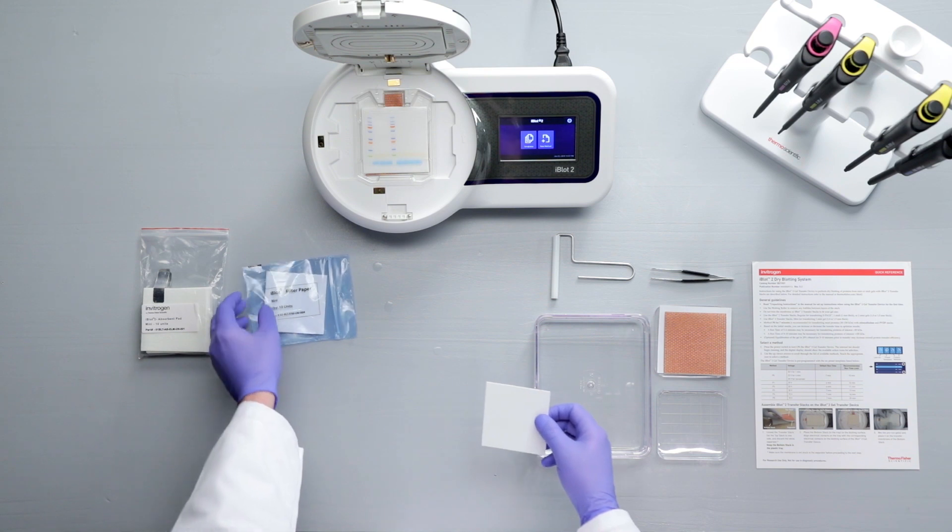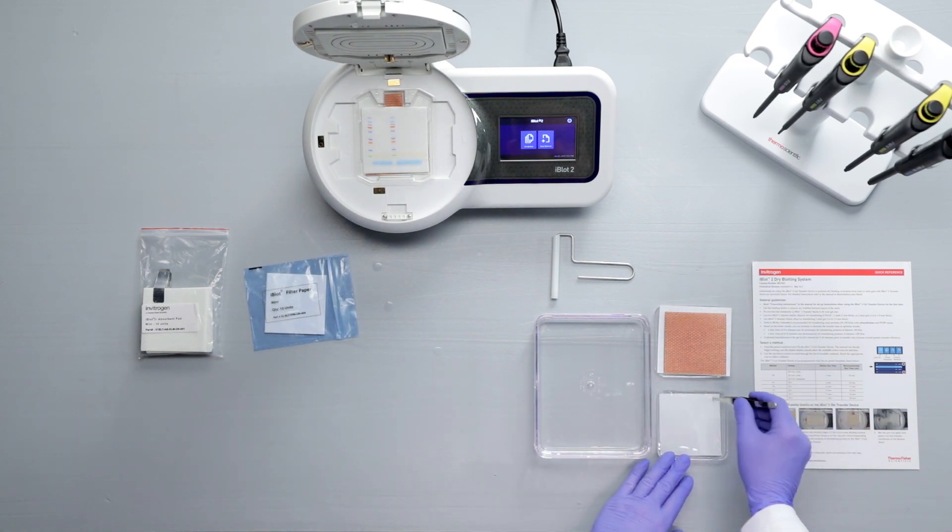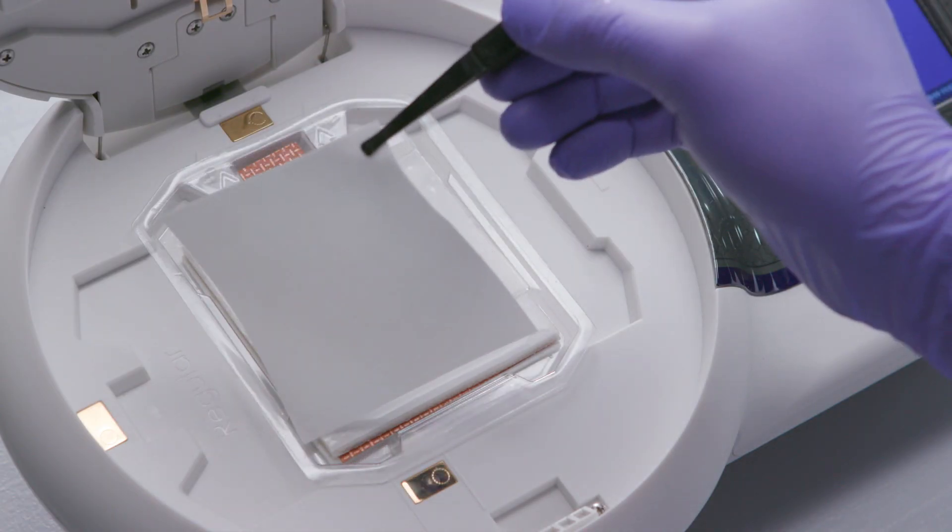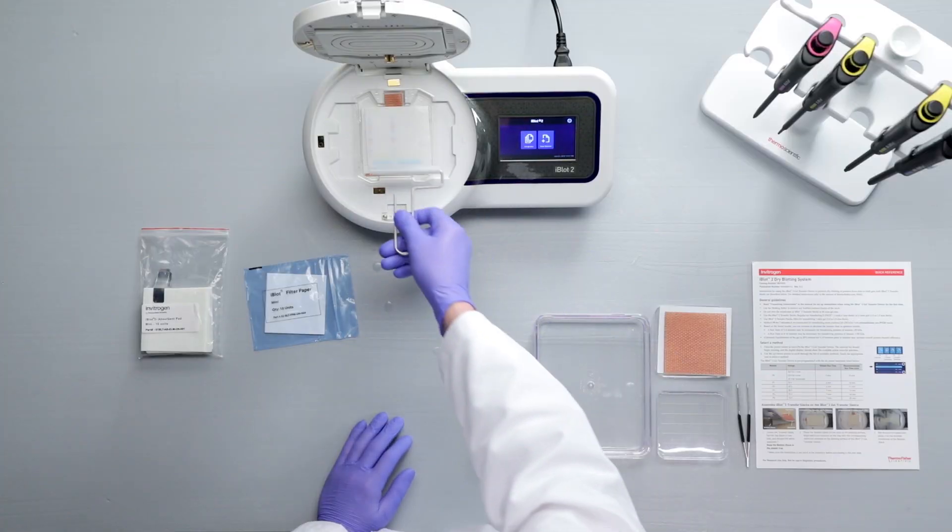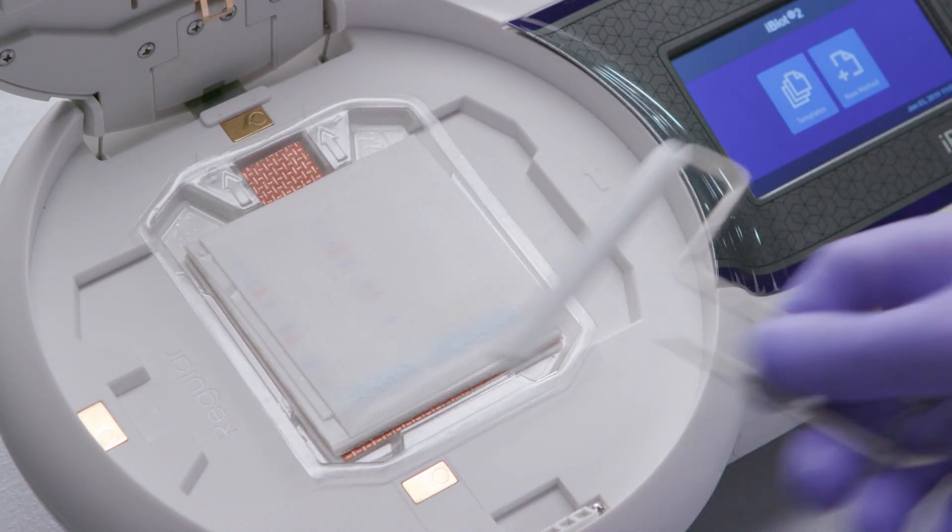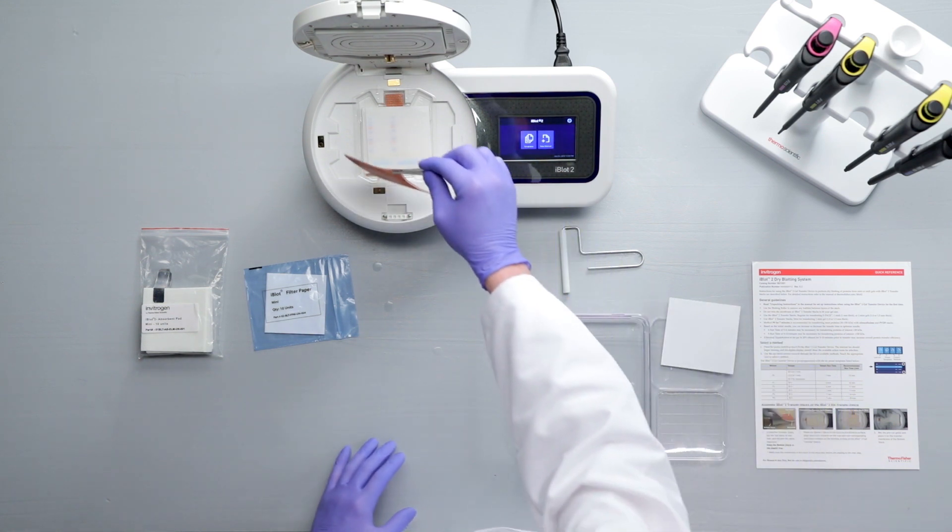Pre-soak an iBlot filter paper with deionized water and place it on top of the gel. Then, remove air bubbles using the roller. Place the top stack over the pre-soaked filter paper and remove air bubbles using the roller.